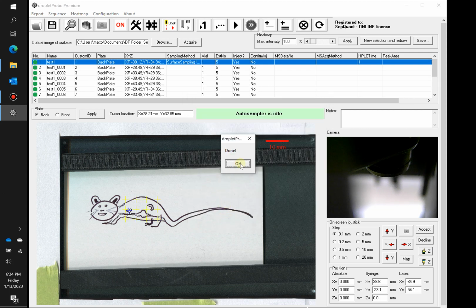Now, just letting you know that it's done, you can see there's, let's see, a lot more than 5. It's more like 12 other samples here in this grid pattern that I want. But let's say I wanted to get rid of some of these, because as you can see, this one right here, this yellow cross, is outside of our mouse tissue.